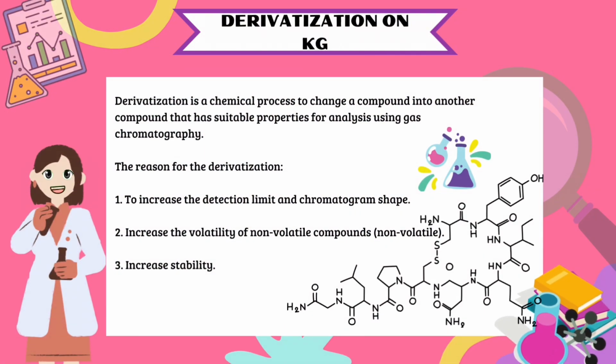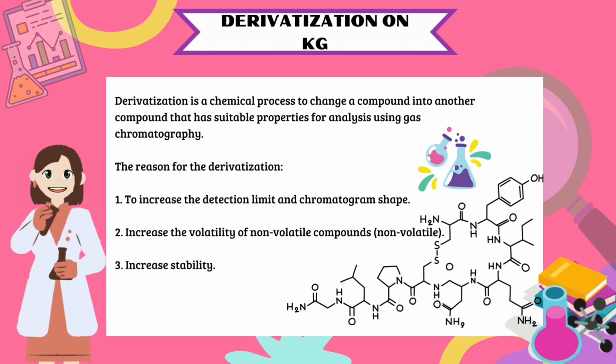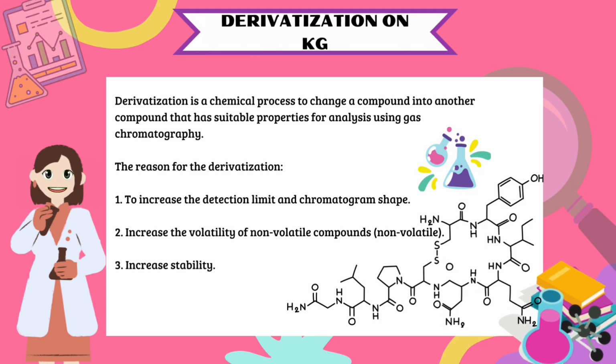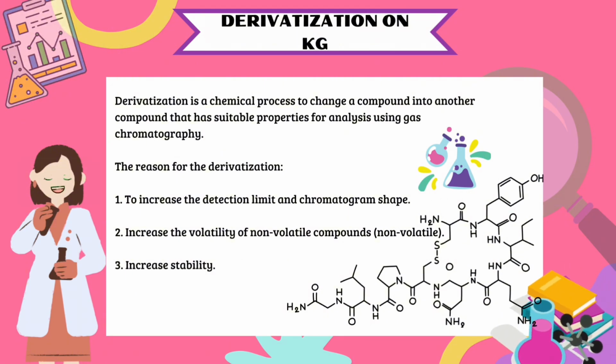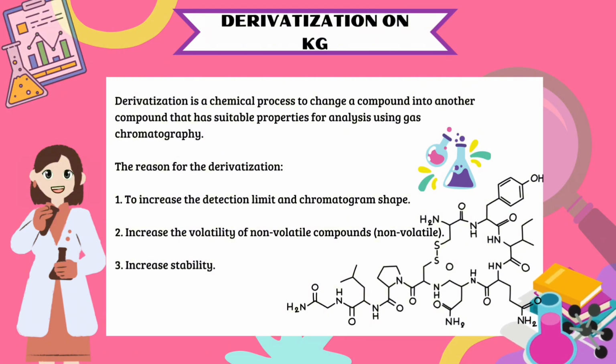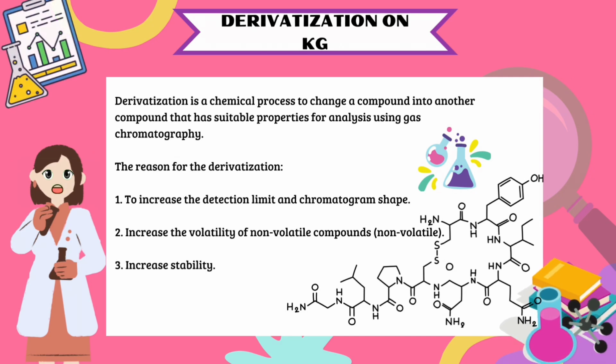Derivatization is a chemical process to change a compound into another compound that has suitable properties for analysis using gas chromatography. The reasons for derivatization: 1. To increase the detection limit and improve chromatogram shape. 2. Increase the volatility of non-volatile compounds. 3. Increase stability.